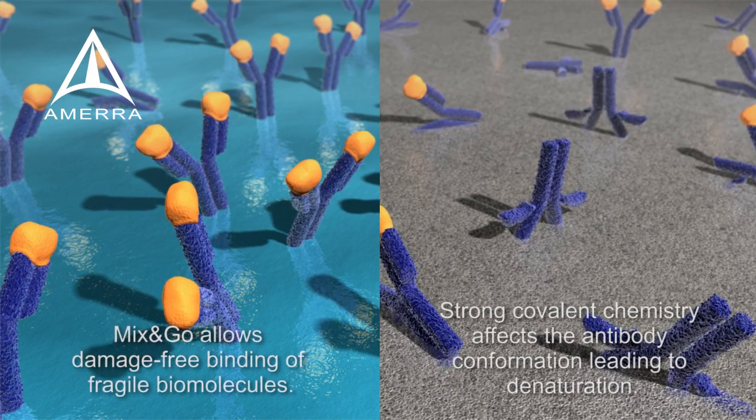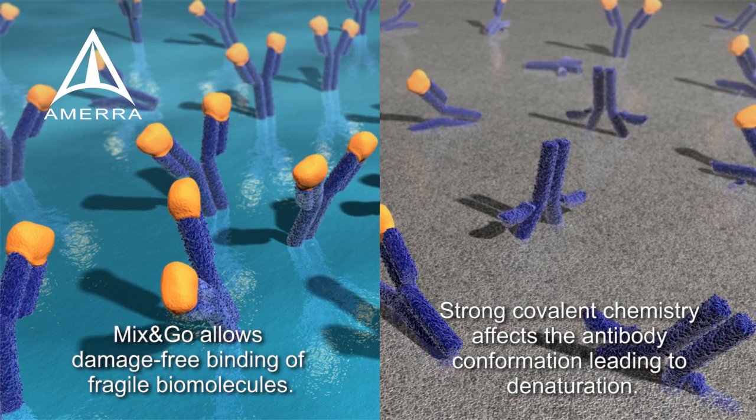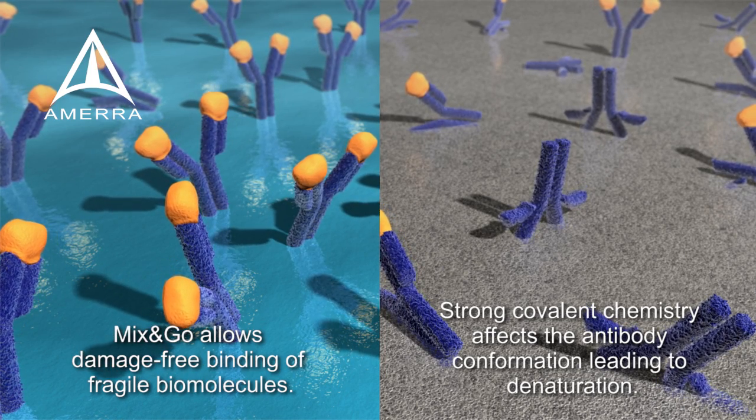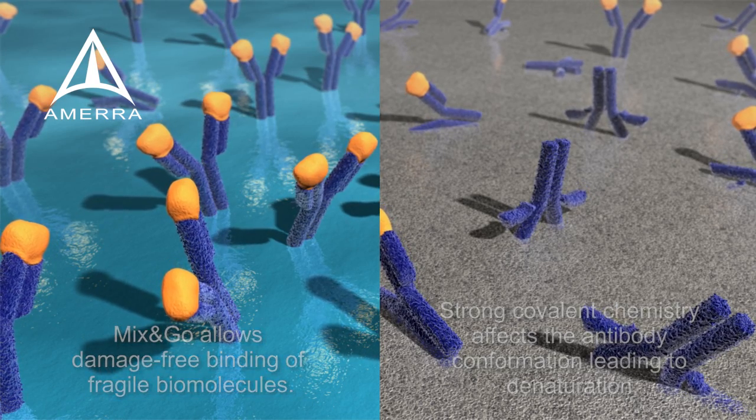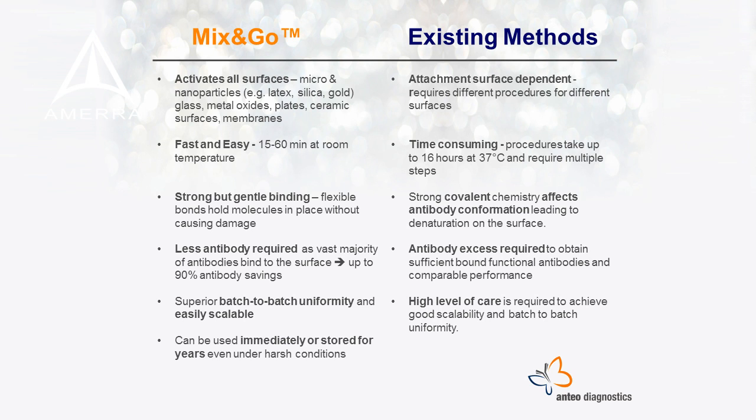In contrast, existing methods depend on very strong binding to anchor antibodies on surfaces, and the protein has limited flexibility — as a consequence, its complex structure is damaged. Mix & Go doesn't just stop here. Our unique technology has many more advantages over the existing methods, and Mix & Go can definitely be the answer to what you've been looking for. For more information, please visit our website at www.anteodx.com or contact us directly.